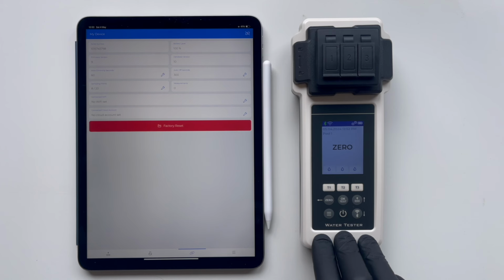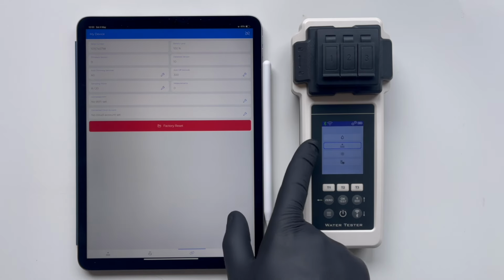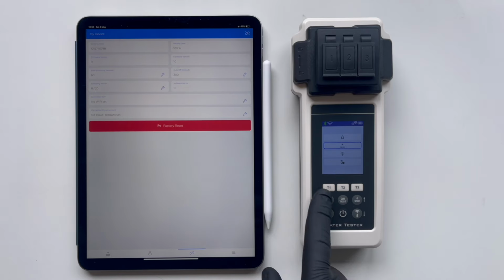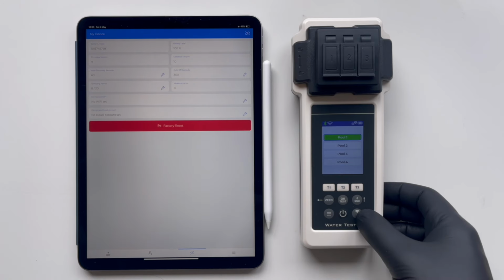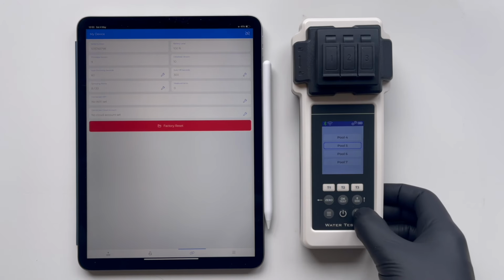To select on the water tester which sampling point we are testing at, you can do this through the menu. Press the menu button. Use the up and down buttons to select sampling points. Confirm your selection by pressing OK. We can now see all the added sampling points. Select the point where we will conduct the tests.